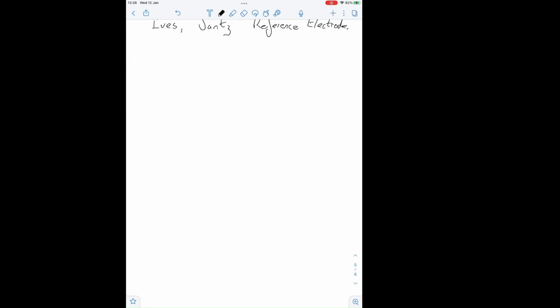Degas, so remember to remove oxygen. Use argon or nitrogen to bubble through your system. I would argue, although you may need an argument with your supervisor, it's better to use argon than nitrogen. The reason for that is that argon is heavier than air.